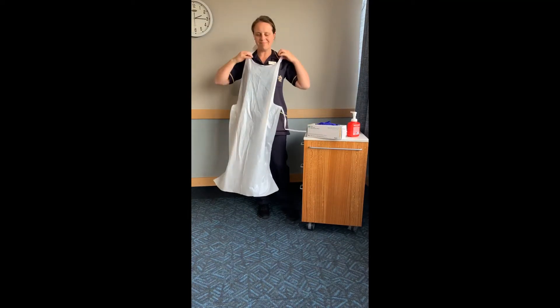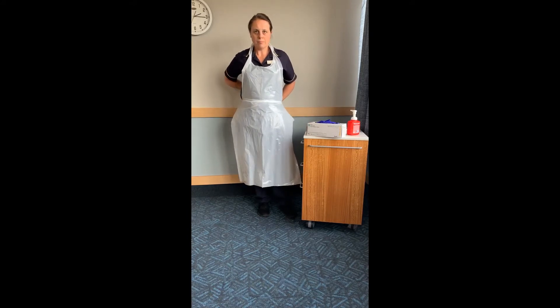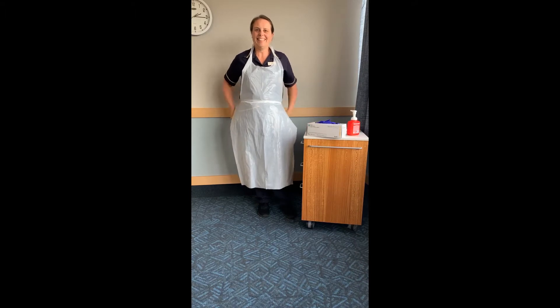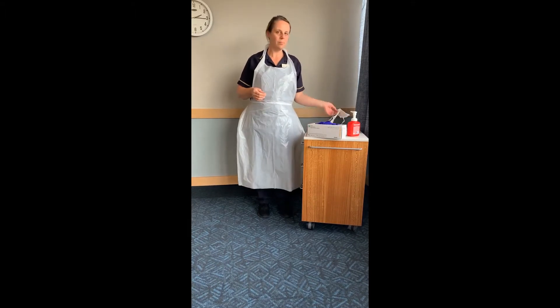The apron is placed over your head and you tie it at the back. If you're thin enough to wrap the apron around you twice, don't be tempted to tie it at the front because it will become contaminated.